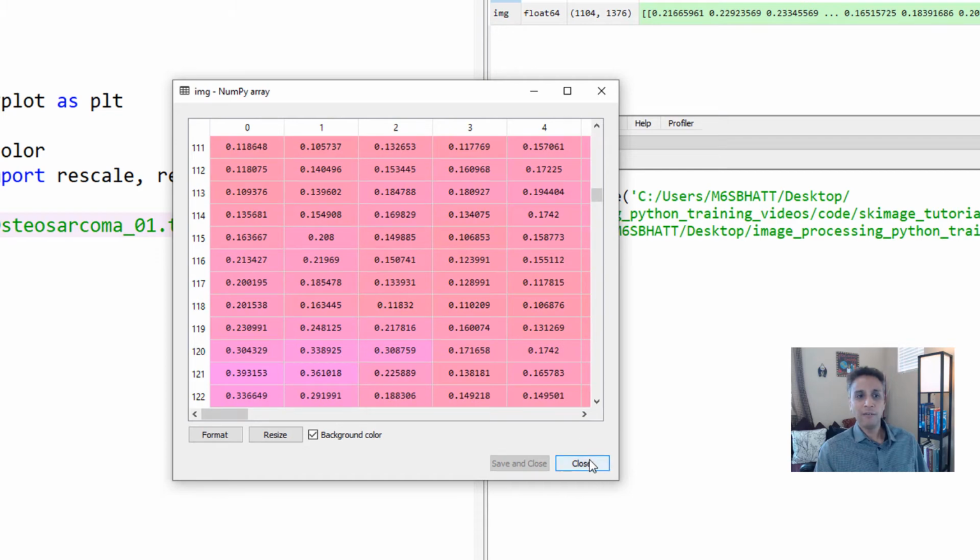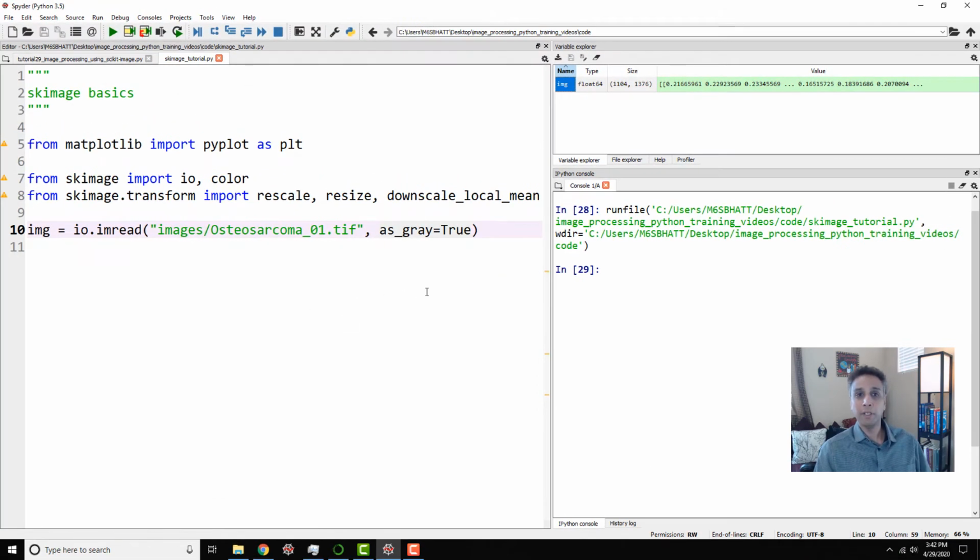Okay. Float in Python can be any number. Again, if I just type float of 29, for example, it's 29.0. Float can be any number in Python, but for Scikit-image, when it converts an image into float, by default, it changes the values to 0 to 1, or rescales all the values to between 0 to 1.